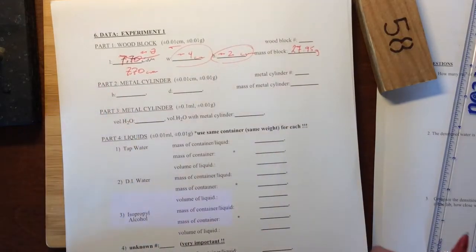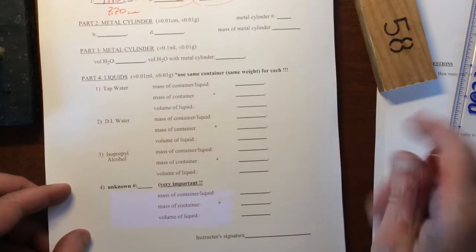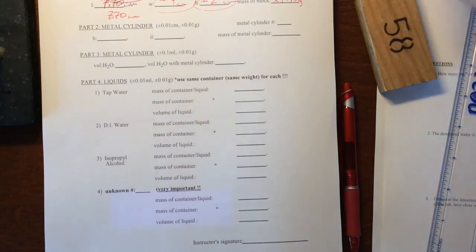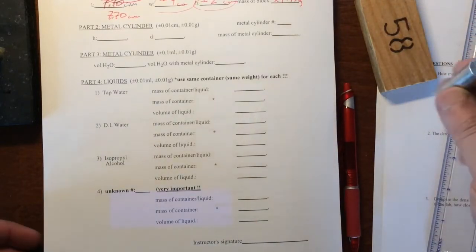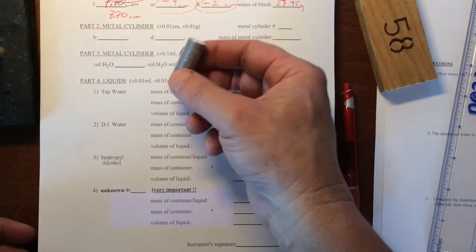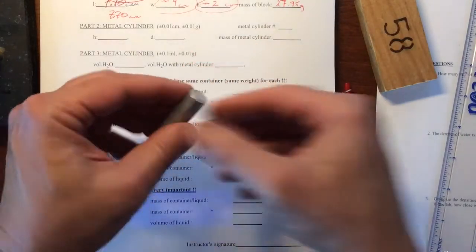Now we don't want to do any calculations yet, because we're still in lab. So now we have to go on to part 2. With part 2, we're going to do the same thing, only now we're using a metal cylinder here. Shiny metal cylinder. So we need the height.